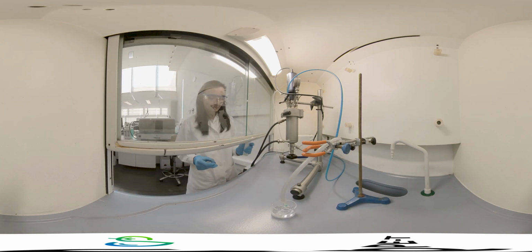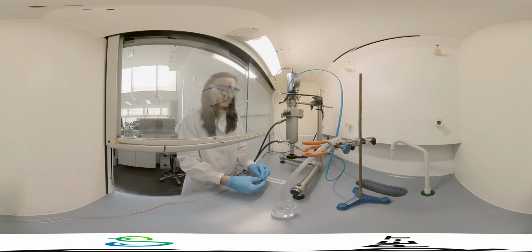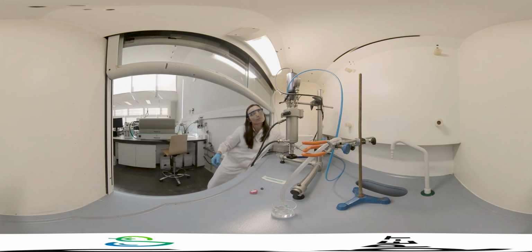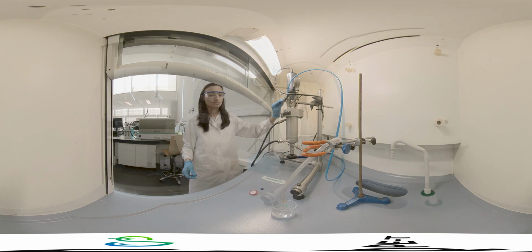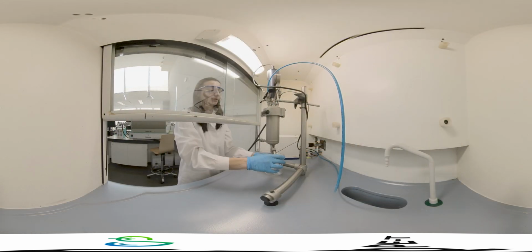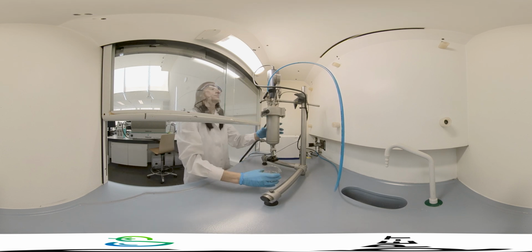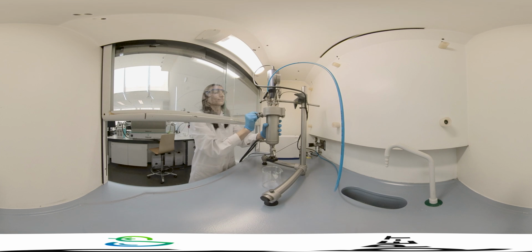Finally, the polyethylene glycol synthesis is carried out by ring opening polymerization of epoxides. To obtain the desired molecular weight, it is important to control not only the temperature and time of the reaction, but also the concentration of the reactants.